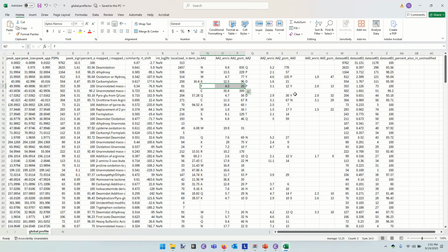But I'm kind of dodging around an important question here. Are we going to submit a manuscript to Nature Biotechnology saying we've discovered these amazing mass shifts on eye lenses? Look at this open search. I strongly, strongly urge you not to do this. People have tried and reviewers like me have shot them down.